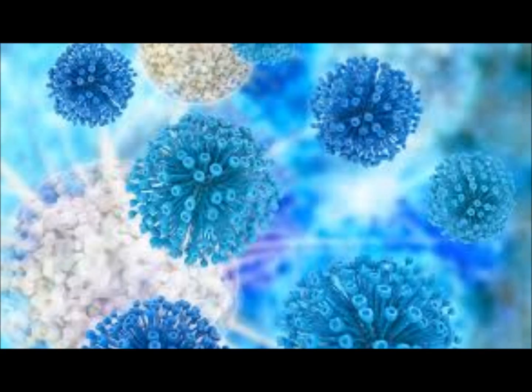BAP and MacConkey. And tell me why we streak for isolation. Why did you have to streak for isolation the organisms that you're going to work on today? What do you want by the third quadrant? Individual colonies. So remember, I think she said do a line like that, and you could do all three plates with one loop, right? You could do your BAP, your MacConkey, and CNA, take that same loop.